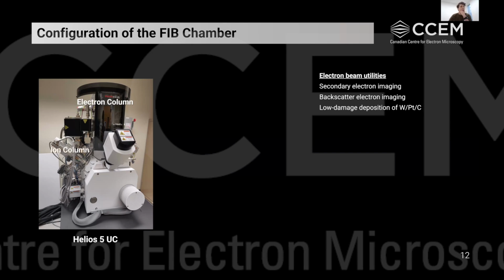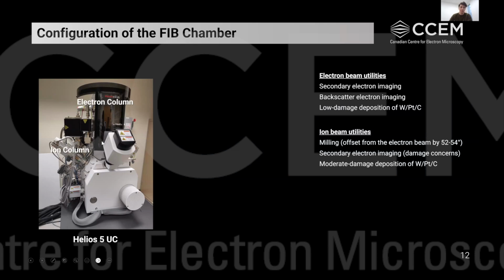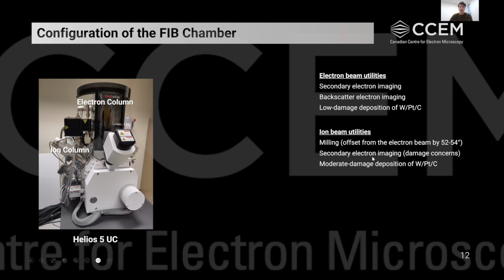Over here on the left, what we can see is our ion column. In this instance, it's generating gallium ions that we're aiming at the sample. And we can use that to do milling, as I just mentioned. This is offset from the electron column by about 52 or 54 degrees. As well, our incident ions are actually producing secondary electrons as well, although it's damaging the sample.